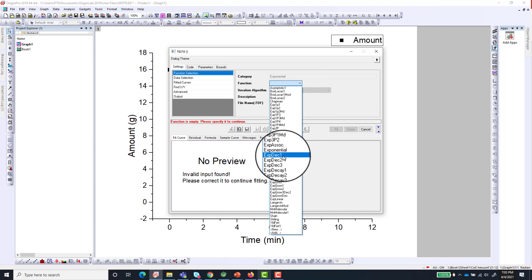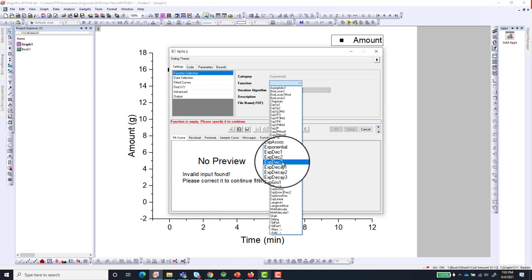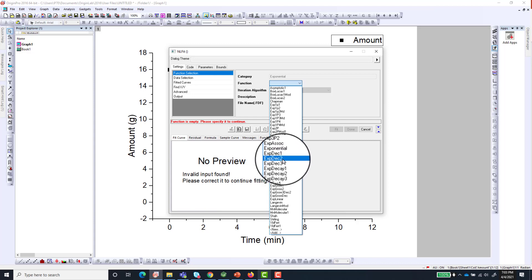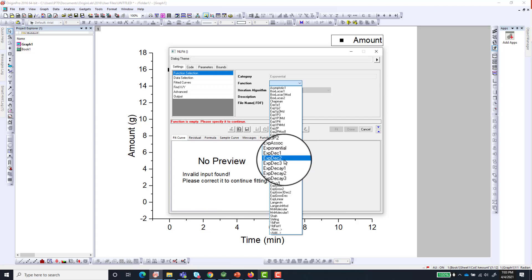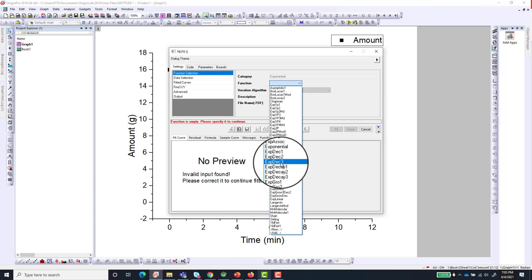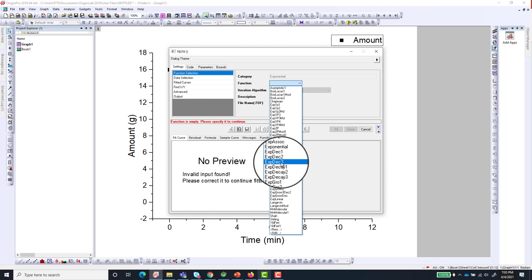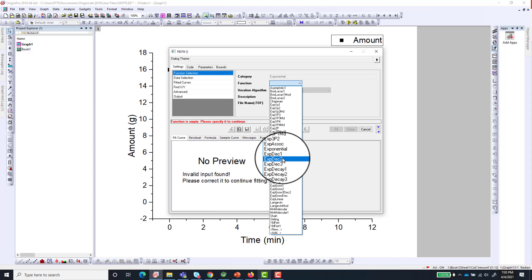So we want to select Exponential Decay or ExpDec1. Decay 1 and ExpDec1 are the same thing. You also have ExpDec2 and ExpDec3. ExpDec2 means you have two phases, a bi-phasic decay model. ExpDec3 means three phases, a tri-phasic decay model.